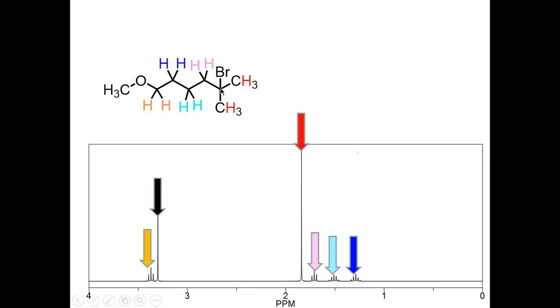Unless there's a proton on the carbon right next door, there's not going to be any splitting. So here, there's no hydrogen. So what is N for this set of protons if there are no hydrogens adjacent? N is 0. And then N plus 1 is going to be what? 0 plus 1, which will be 1. So it should be a singlet.